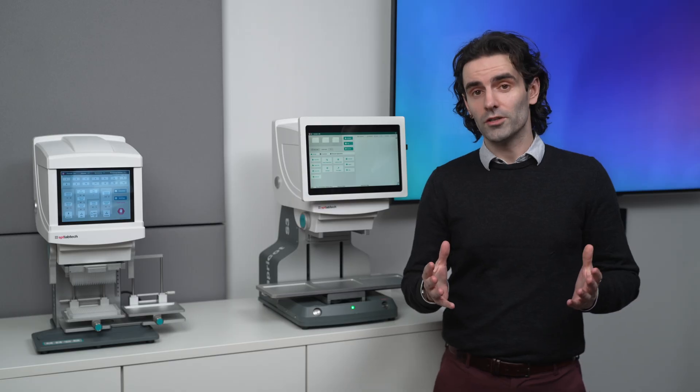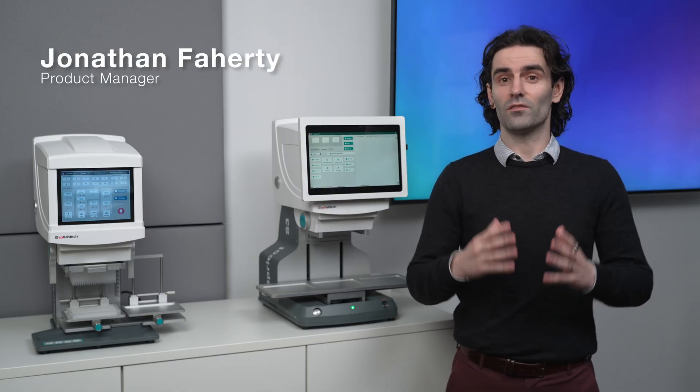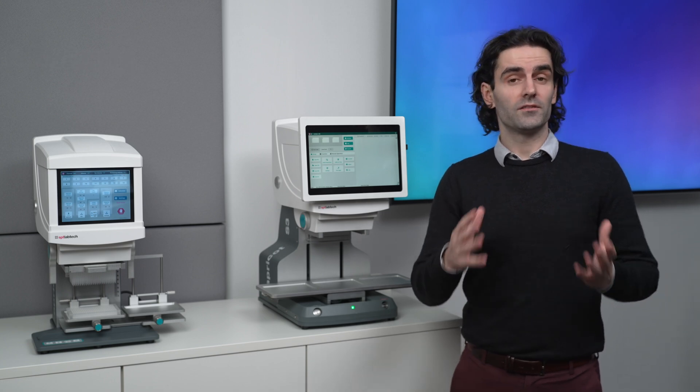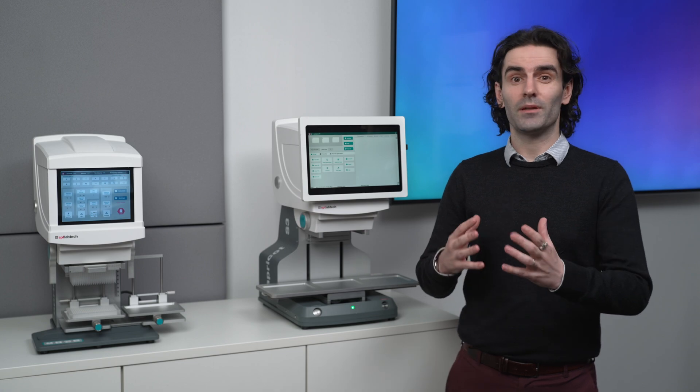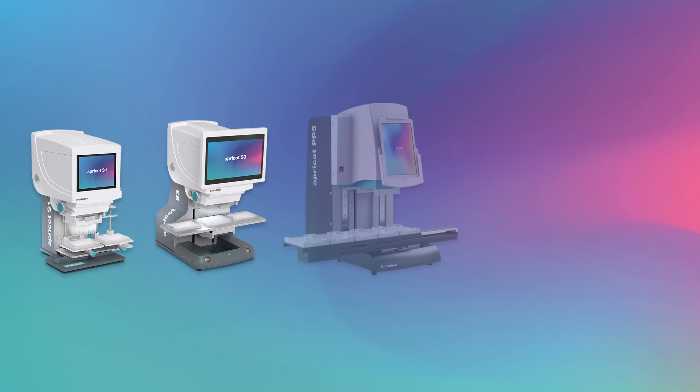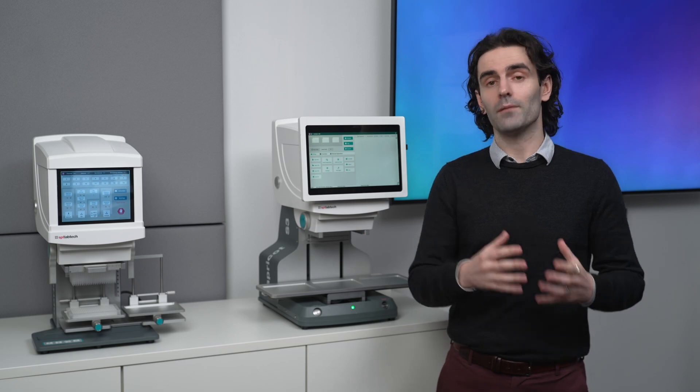So you're interested in automation, you've heard about the Apricot product family, but you're not sure which instrument is the right one for you. In this video, I'm going to give you an introduction to the Apricot family, tell you a little bit about each instrument, starting with the S1, the S3, the PP5, and finishing with the DC1, and hopefully give you an idea of which instrument might be the best fit for your lab and your workflows.